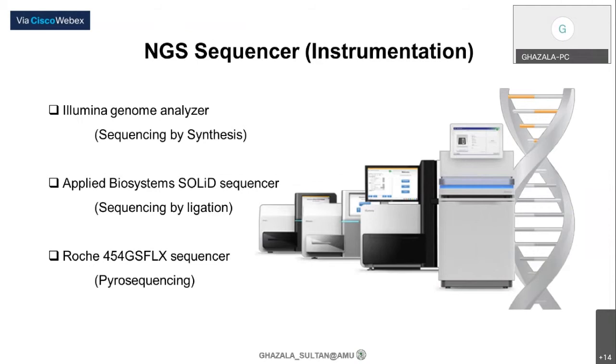So let's proceed. Since everyone attending this session might already have an idea what NGS is, generally, it is a kind of parallel sequencing, which is better than the earlier sequencing methods, for example Sanger sequencing. This parallel sequencing can be done within a few minutes, but earlier sequencing methods took days and months to complete for a small amount of data. So there is a big advantage of NGS over other sequencing methods.